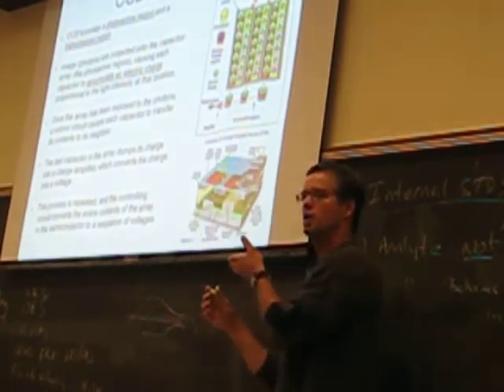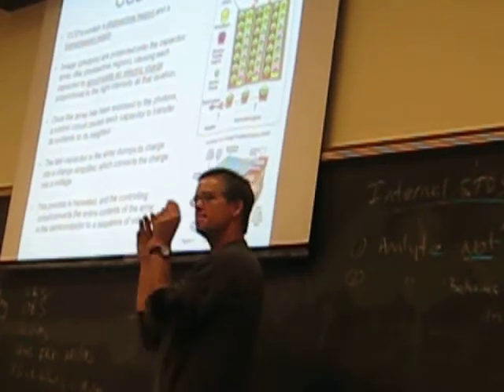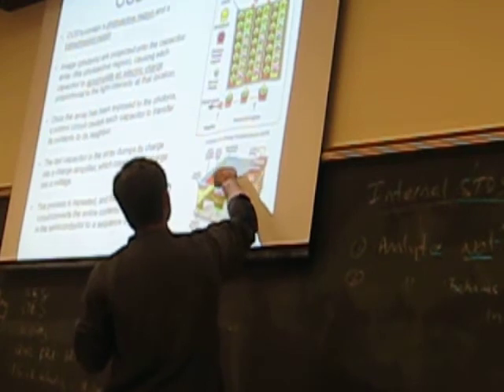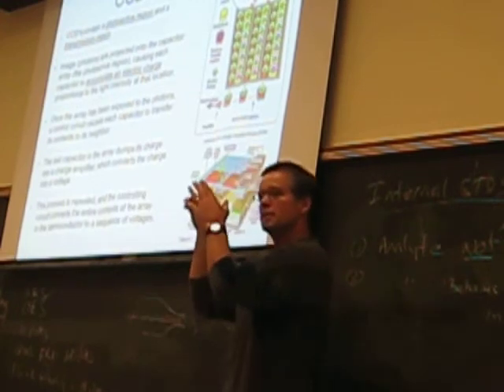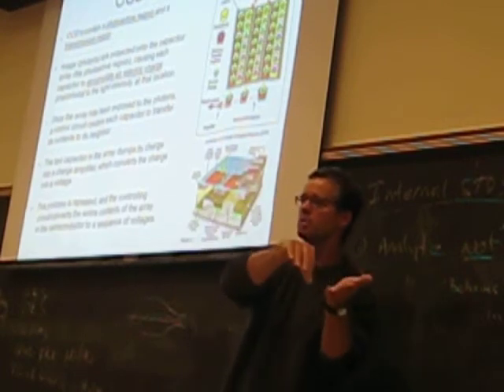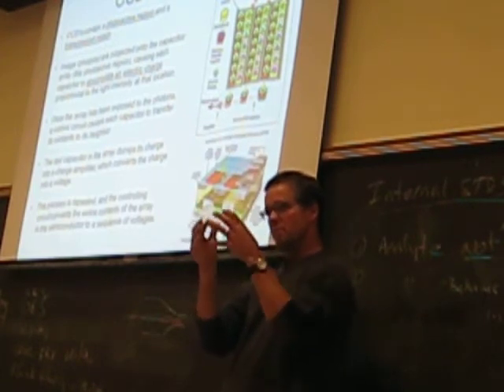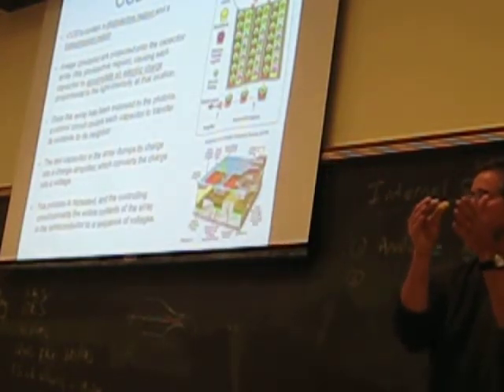And what makes this special in charge-coupled devices is that they can have an array of these photoactive surfaces at very small resolution, right, down to the micron or nanometer size. And when those photons hit, they release electrons. Those electrons are transferred over into a register where those electrons will build up until they trip essentially an overflow gate, and then they get transferred to another register. And they can actually store electrons as the photons are hitting the surface until they reach a certain buildup of electrons, and it trips a gate, and those electrons will then flow to an adjacent register and ultimately be measured.